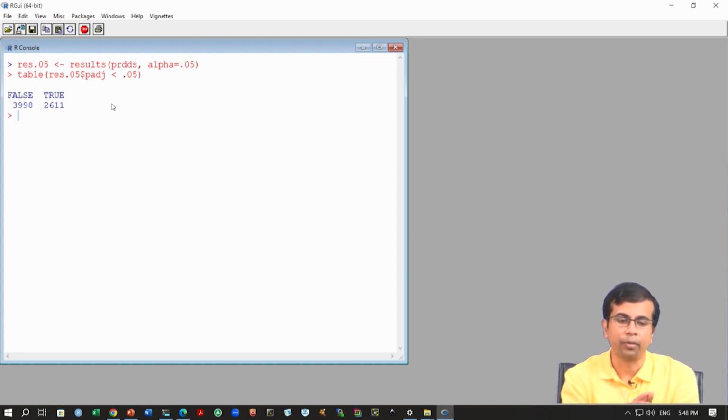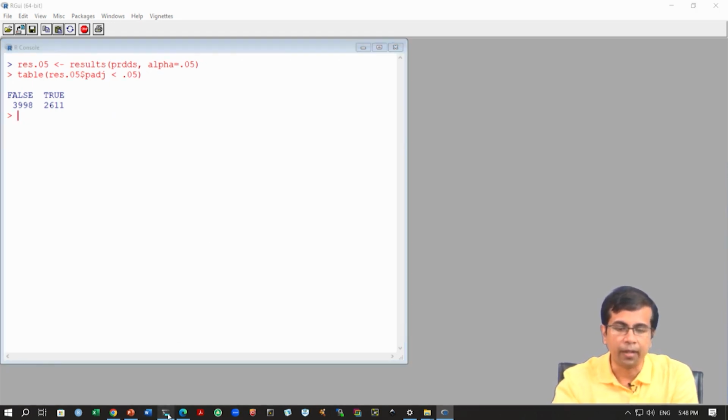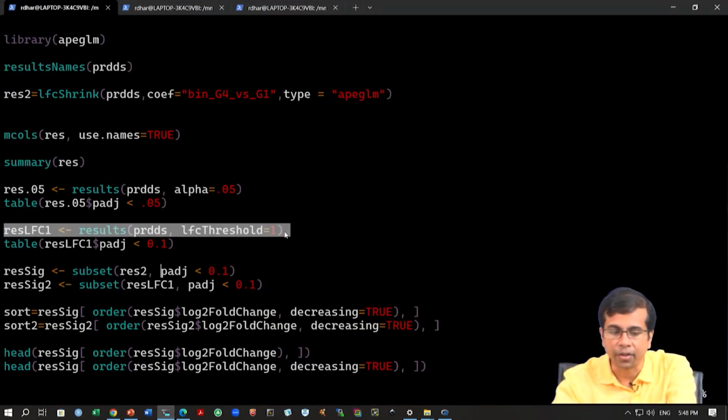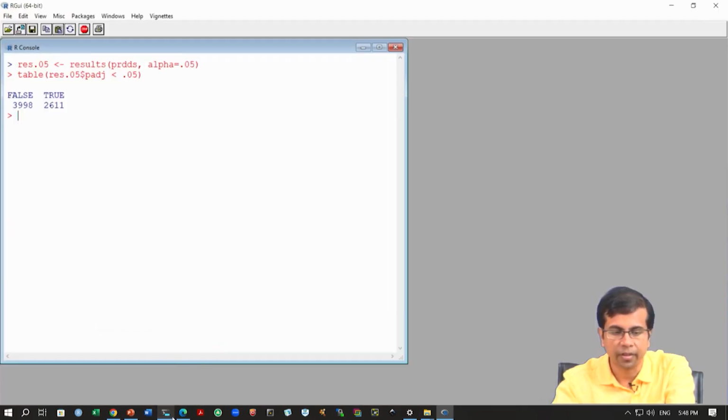We have seen about 24% genes showing up regulation, 21% genes showing down regulation. Here in total about 2600 genes, right? So we are making this more stringent. Okay, so similarly we can use these LFC thresholds, right, and we can see whether we can generate.